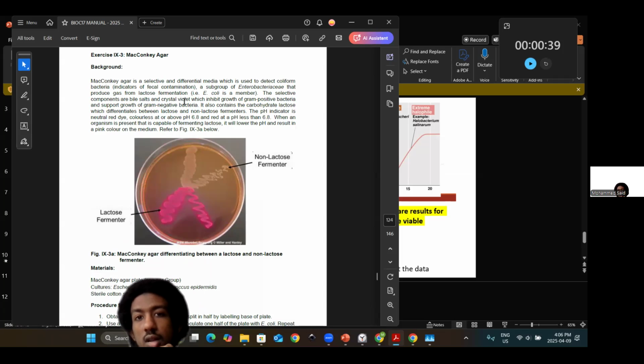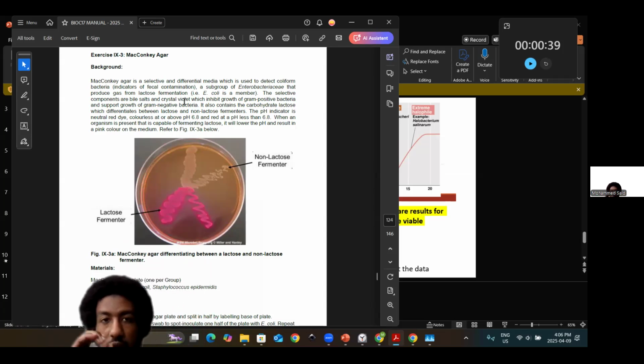We'd heat fix and then do crystal violet staining. But these are now dealt with in live cells. So crystal violet as a stain, as a dye, coupled with bile salts, you can imagine that it's going to be selectable in a sense that, if crystal violet passes through, hypothetically, now with NaCl, right? Think about the osmotolerance, right? Think about gram-positive bacteria, but think about it like this.